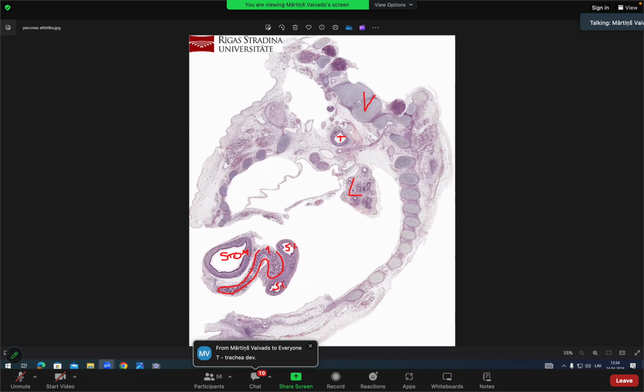Yes. Technically, you will see there's a plate of hyaline cartilage here in front. So there's a plate of hyaline cartilage. You will see this, like the trachea. Yeah, like in histology, the same idea is present. Anatomy. If you would zoom in, you would see these rings. But typically, this is a very, very rare slide variation.